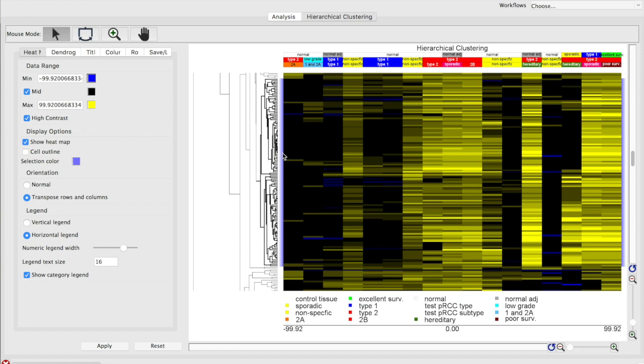Today, we're going to continue our bioinformatics analysis of these 130 genes, but we're going to use a different program to analyze this. We're going to use Correlation Engine. So this is the program we actually use to gather all the metadata.